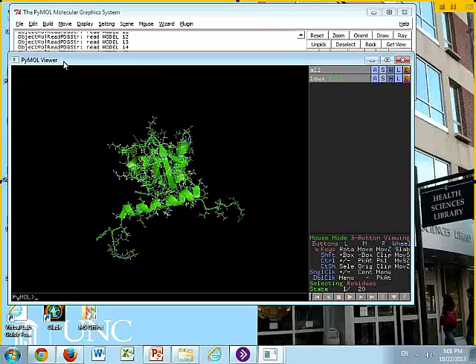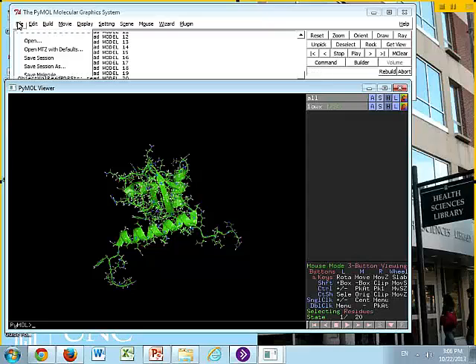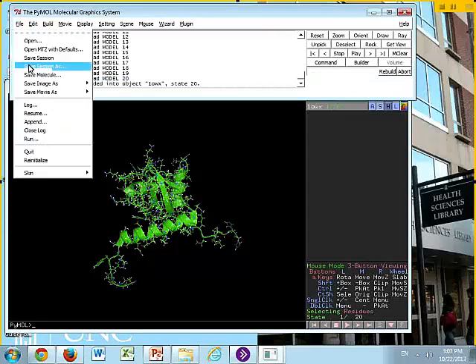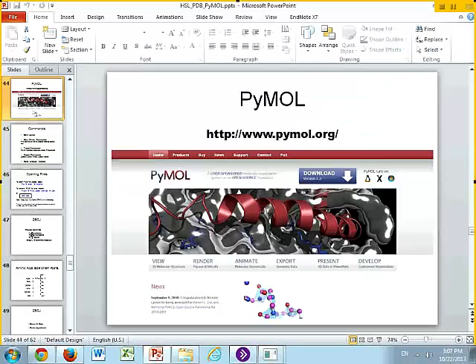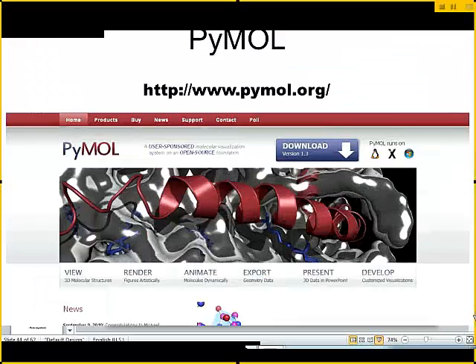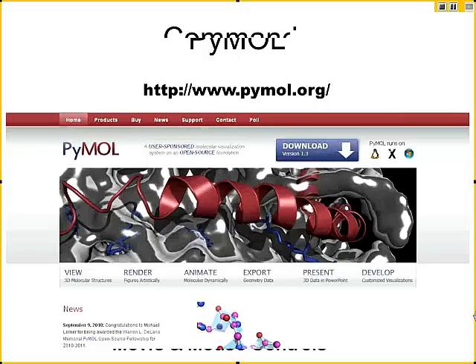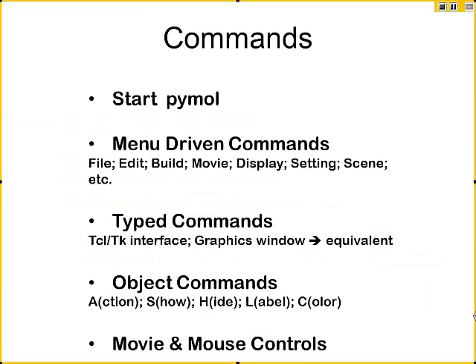Now, we're going to stop this, and we're going to come up to the top, we're going to file, and down at the bottom, reinitialize. So we're going to go back to the start as if we hadn't done anything. Now, I'm going to come back to my slides, and I want to introduce some things to you.